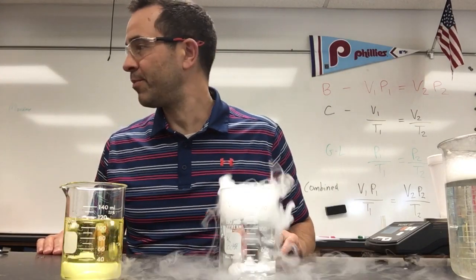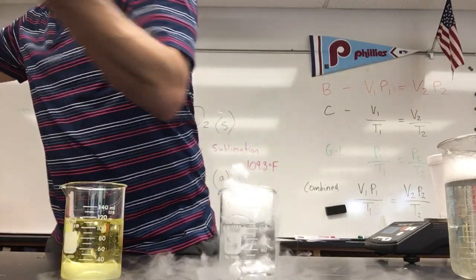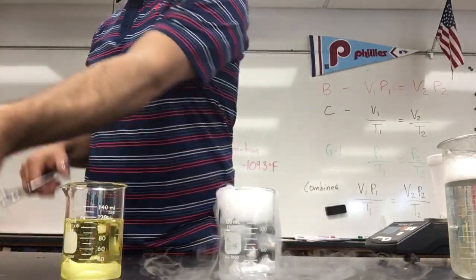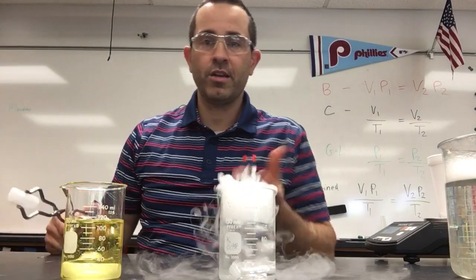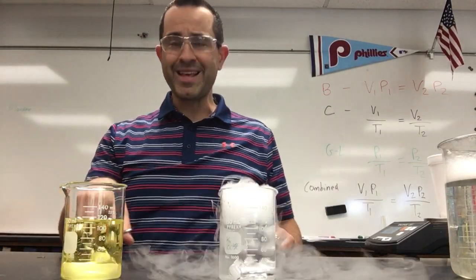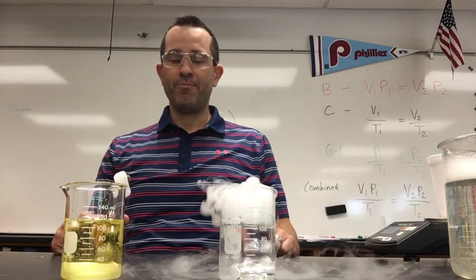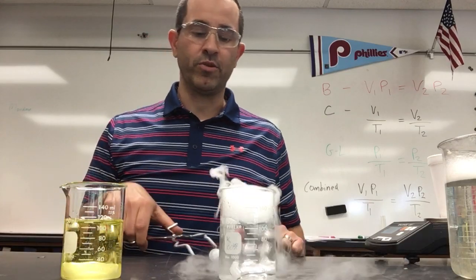Next up, let me get our piece of dry ice from my cooler. I'm using tongs to pick it up because it's super, super cold, like negative 100, negative 110 degrees Fahrenheit. Maybe at some point in your life, somebody played a mean trick on you and put some salt in your hand and said, take this ice cube and squeeze it, and it hurt really bad. That's roughly 0 Fahrenheit. We're talking over 100 degrees colder than that. So this will cause some very painful experiences very quickly. You never ever want to grab dry ice with any sort of force.